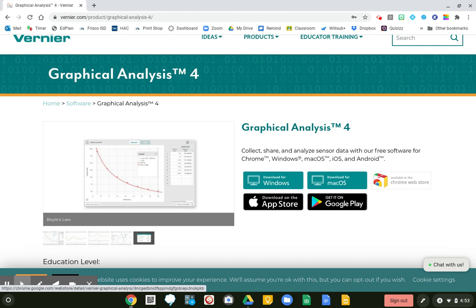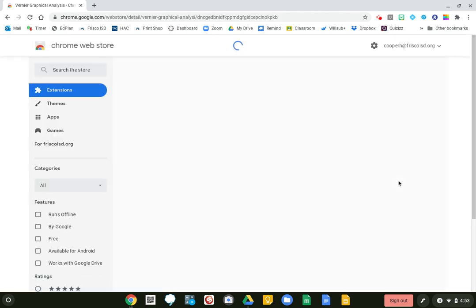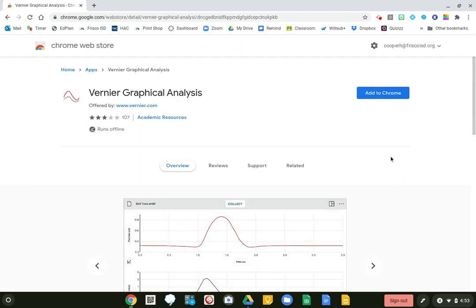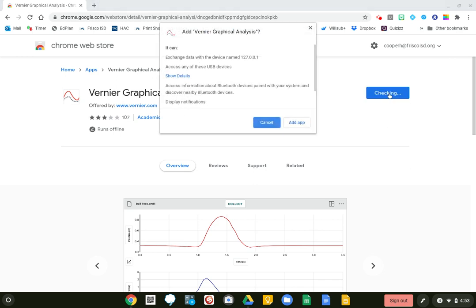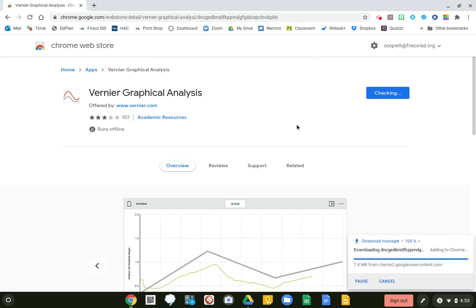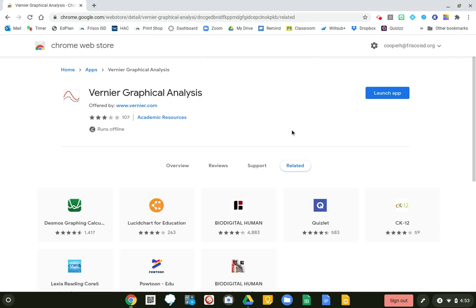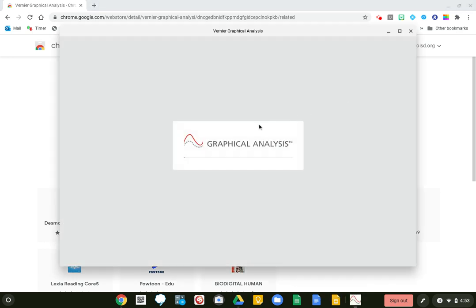I'm going to go ahead and click on the Chrome Web Store. I'm going to add it to Chrome and add the app, then launch the app.